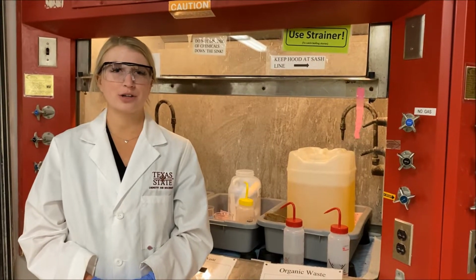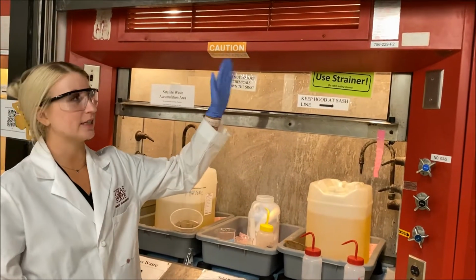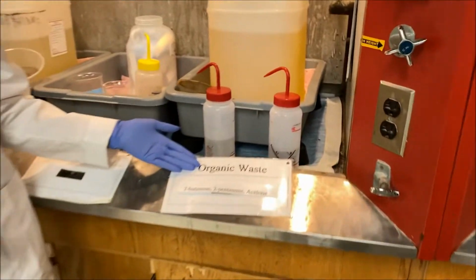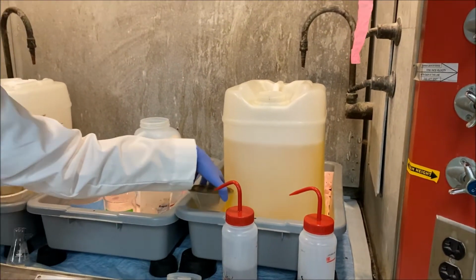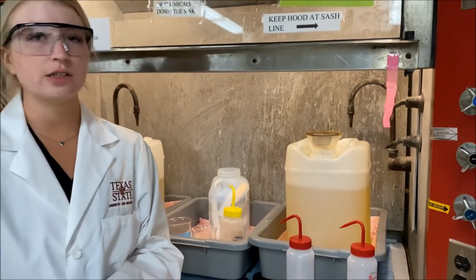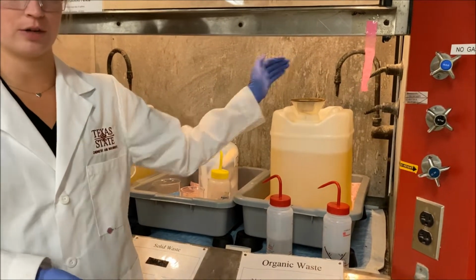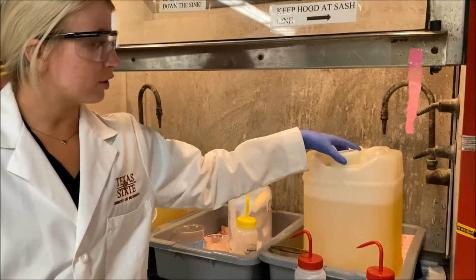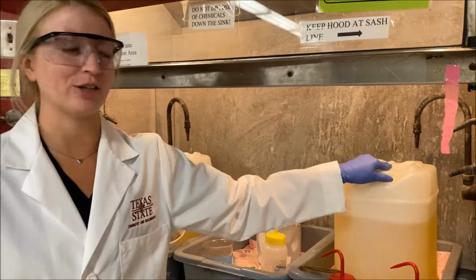So now we're going to show you where all your waste disposal bins can be found. They'll usually be under your fume hoods, which you can see is this apparatus right here. And for your organic waste bin, you'll find the one that's labeled organic waste, which is right here, and that's where all your organic waste will go. You can use the funnel and the strainer together when you're pouring out waste that contains solids you need to catch, like boiling stones. And you'll just put it in here and pour it directly through the strainer. And then whenever you're leaving lab, your IA will be sure to close your waste bin, and it remains closed when it's not in use.